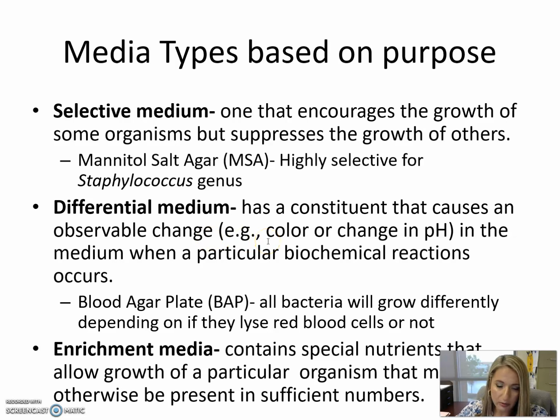However, the bacteria will grow different colors based on how they interact with the contents of the media. Typically, when they interact with the contents of the media, there's some type of observable change, usually a color change that's due to changes in pH. But the main thing is everything's going to grow, but it will grow different colors based on interaction with the media, which usually tells us something about the bacteria.